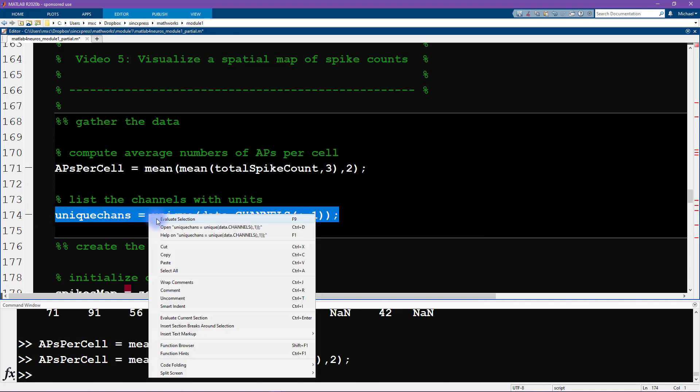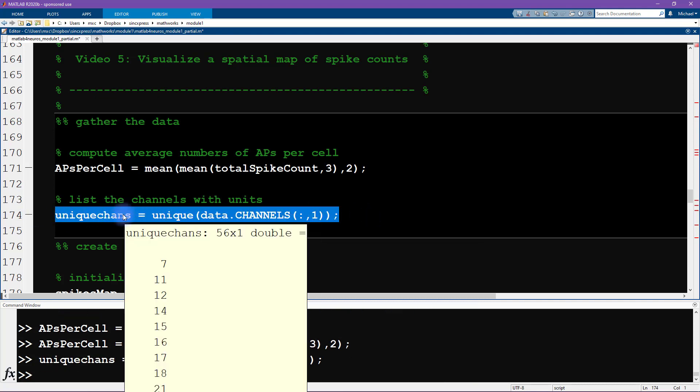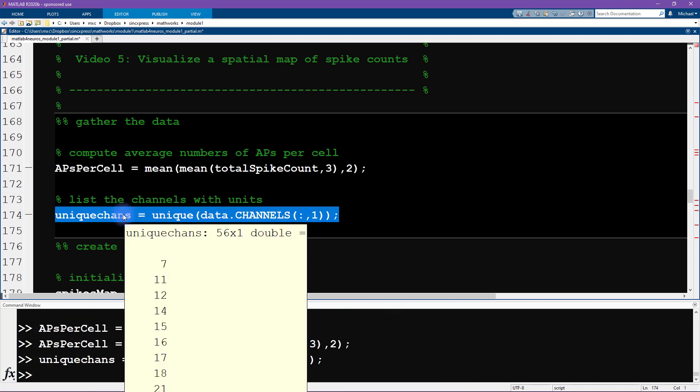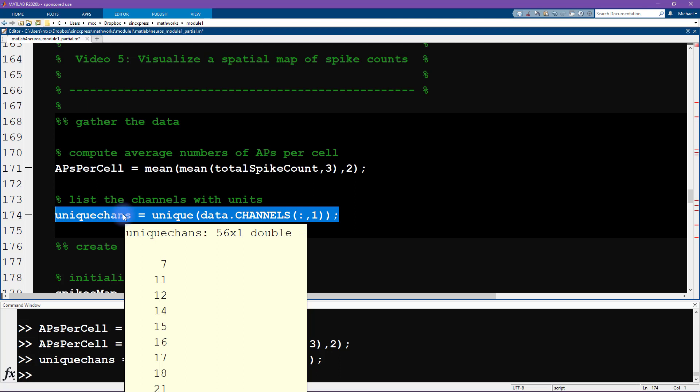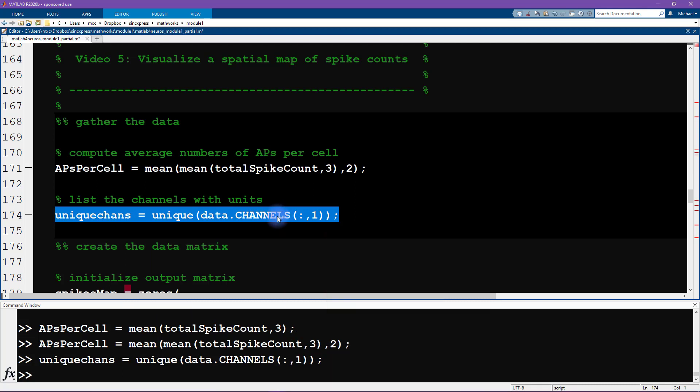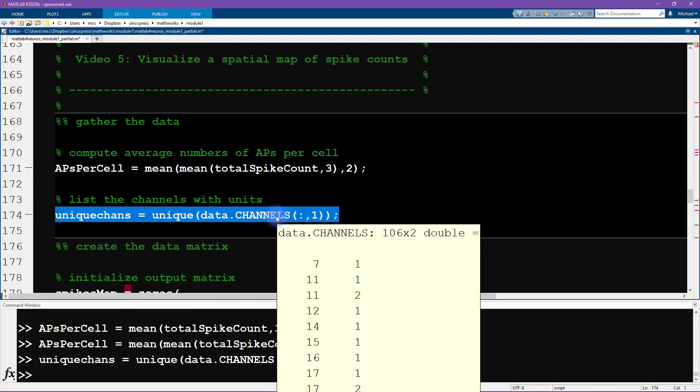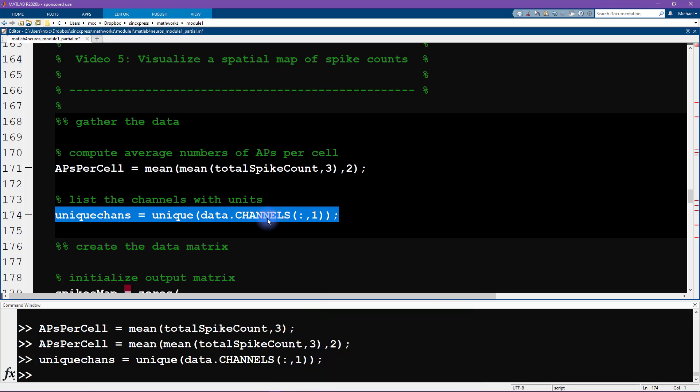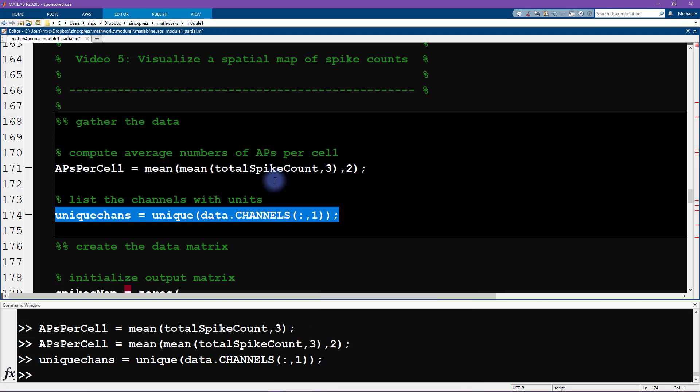And then here, I'm getting the list of all of the channels that contained units. So this is just all of the unique elements of data.channels, and we want all rows and the first column. So this is telling us that there are 56 channels in total that had at least one neuron recorded on that physical data channel. On that electrode. And the reason why this is 56 and data.channels is 106 is that there's many neurons that were recorded on the same data channel, the same physical electrode.